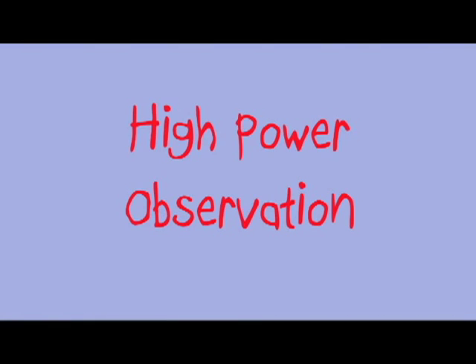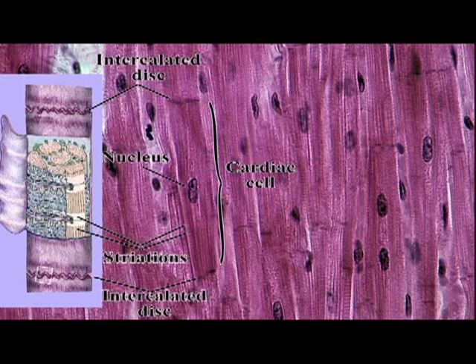High power observation shows the detail of the cells. This workbook illustration is compared to a labeled cell that clearly shows striations, a single centrally located nucleus, and intercalated disc. The gap junctions located in the intercalated disc allow the heart to work as a unit, propagating the waves by electrolyte movement for the heartbeat.